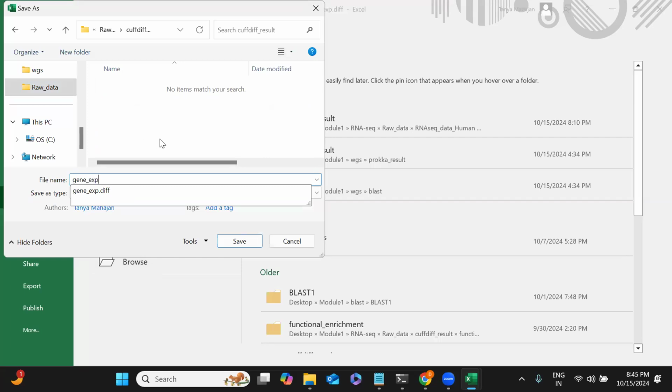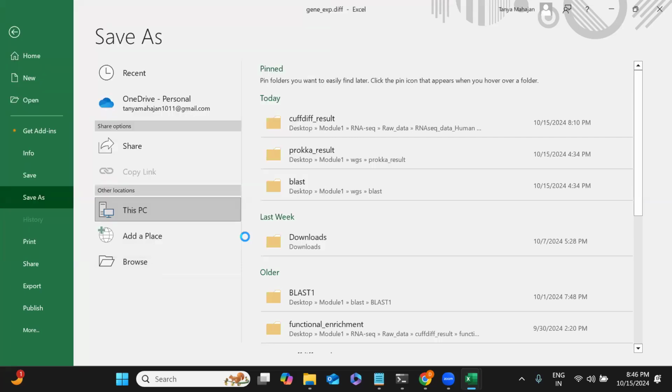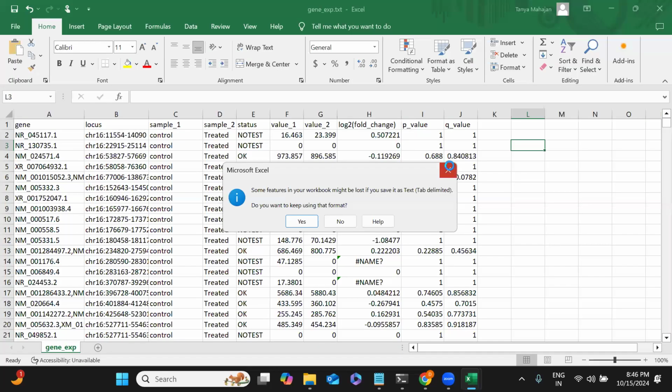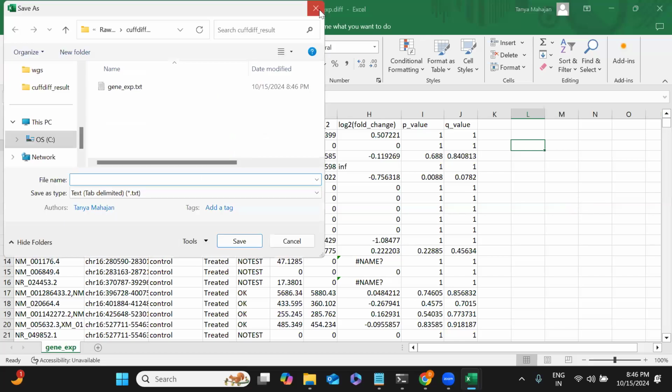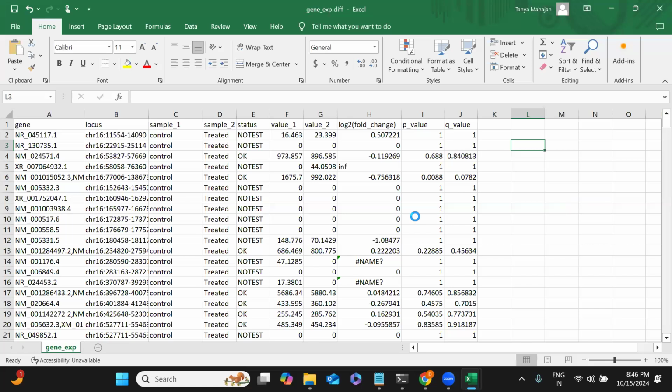No, it depends on which data you are dealing with, sir. If you are dealing with de novo data, the result will be different and the pipeline will be different for that. This you will get only when you are isolating the RNA, sir, and also when you are dealing with the transcript only.